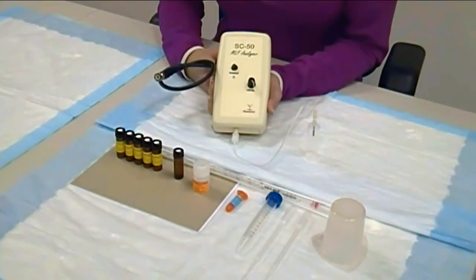Hi, I'm Rachel from Vinmetrica. I'm here to show you Vinmetrica's new SC50 MLF Analyzer. This makes measuring malic acid in your wine quick, easy, and accurate.